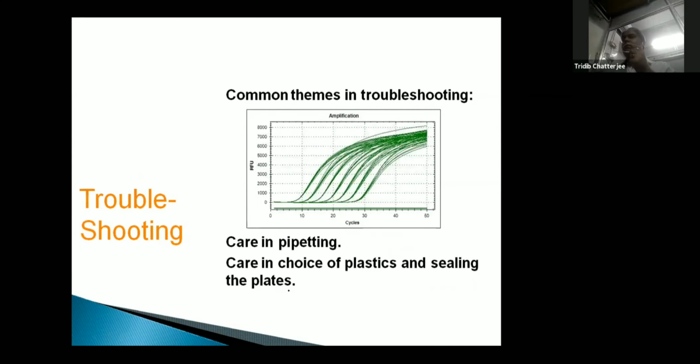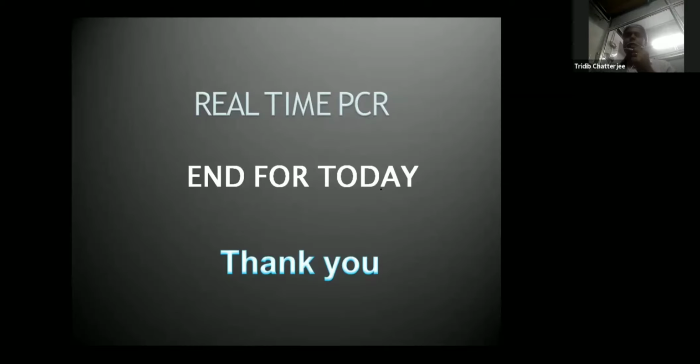And finally, the take-home message is to take care in pipetting, take care in the choice of plastics, and seal the plate properly. There should not be bubbles present. Then ultimately your curve should be like this. Thank you.